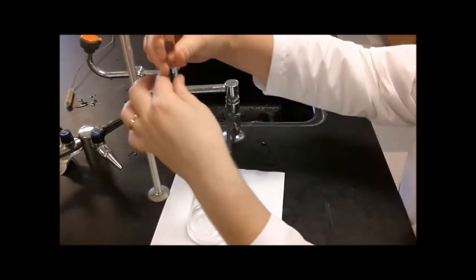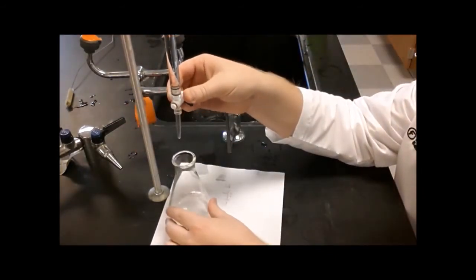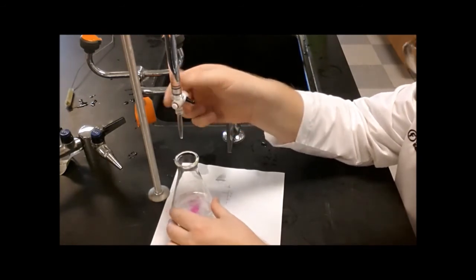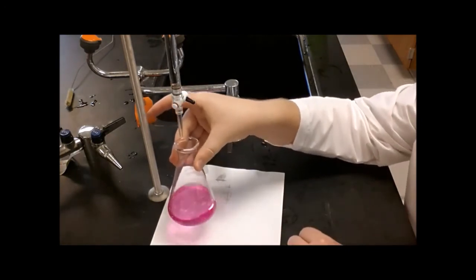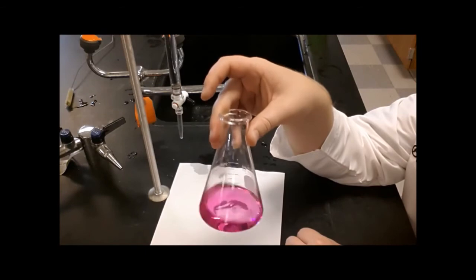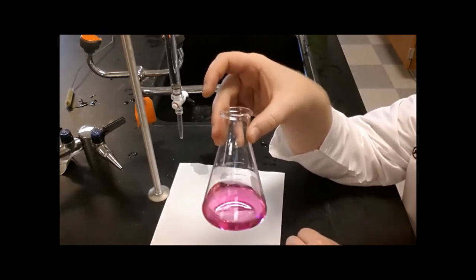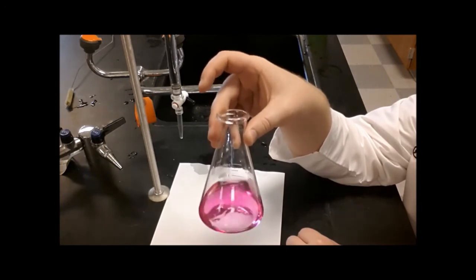So what I can do is open the stopcock very slowly, and I can actually get a droplet to form on the very tip of the stopcock. And oh my goodness, see that violent sort of fuchsia color? That means I overshot the endpoint. I went too far. Okay, if you get this particular color, it means that you failed your titration and you have to start over.